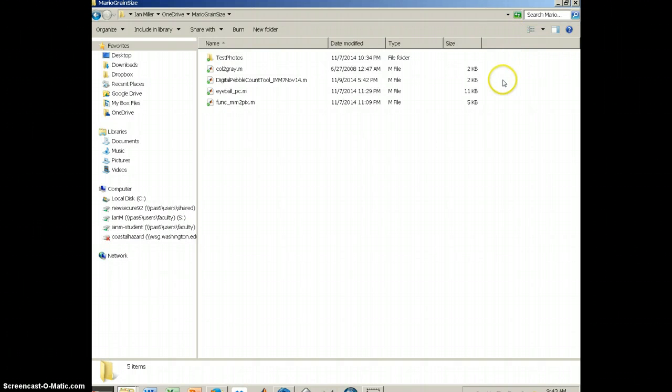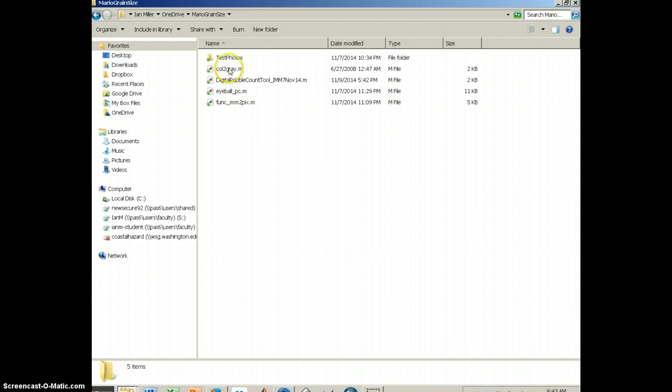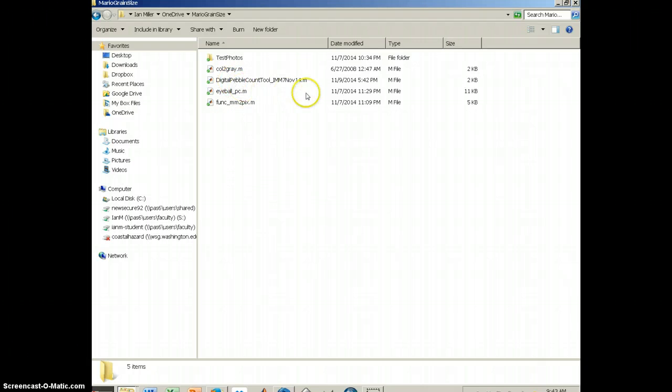The first thing to do is to arrange your folder correctly. The folder can be anywhere on your computer, it can be on a flash drive, but it needs to have these four scripts, these are called .m files, and they all end with .m, these are MATLAB files.